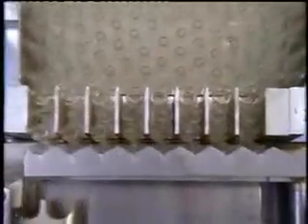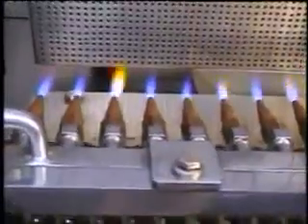Empty washed and sterilized glass ampules are fed into the SS mesh chain conveyor or SS hopper from the left-hand side of the machine. Eight ampules are fed through a feeding cassette to the receiving rack. The moving rack, which moves horizontally, collects 8 ampules and conveys them from left to right in an inclined position through pre-gassing, filling, post-gassing, pre-heating, and sealing stations.